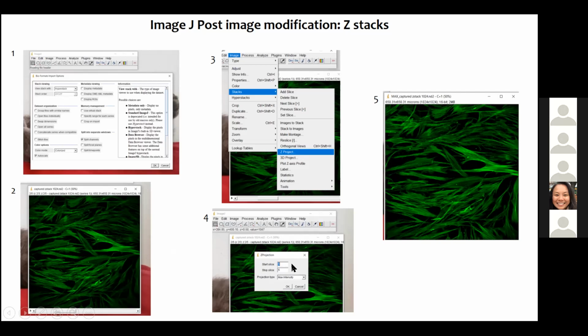So you always want to remember that whenever you're comparing 2 samples, wild type and treated, you want to do the same modification that you're doing to the wild type to the treated. So you want to make sure that everything matches, because if the reviewer has any doubt about your data, they can ask you for the raw files, and whatever changes you did or did not do or forgot to do to one sample, it's going to get red flagged.